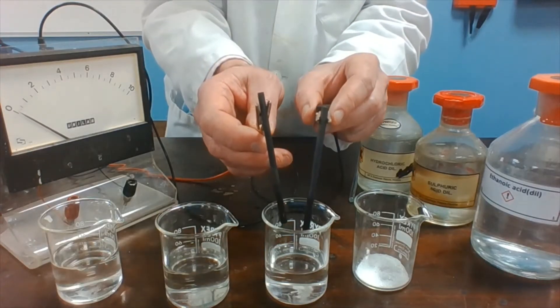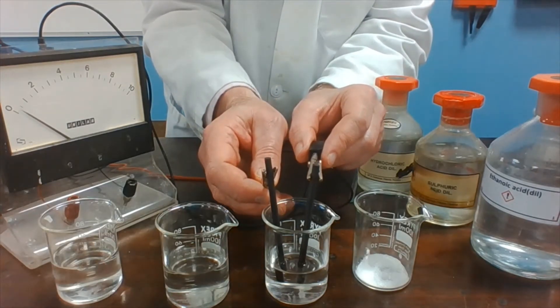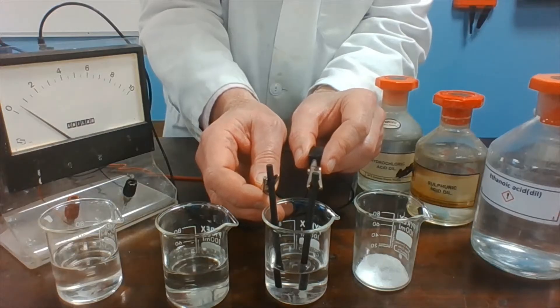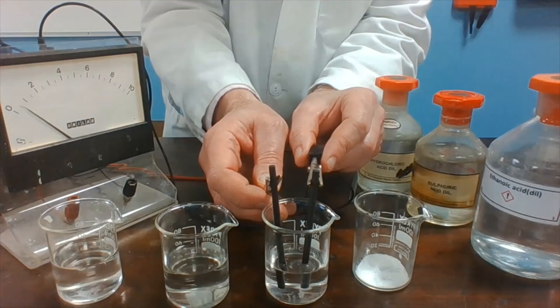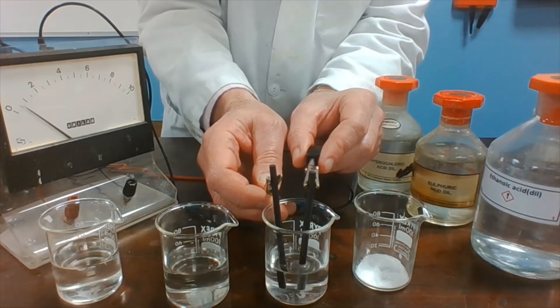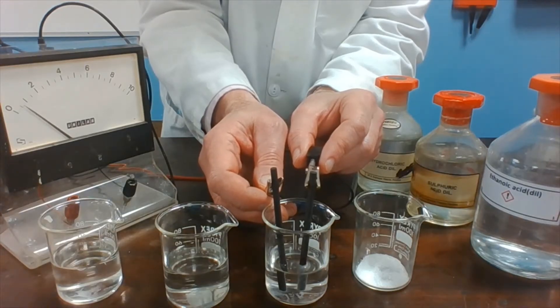Moving on to the ethanoic acid. This time, there is only a slight movement on the ammeter. But there are still bubbles of gas coming off at the electrodes, if you look carefully.